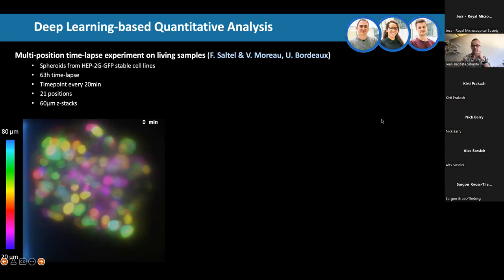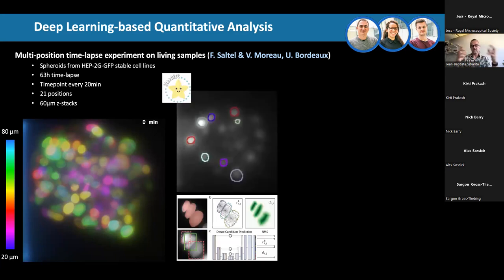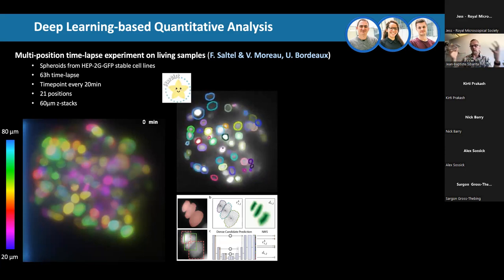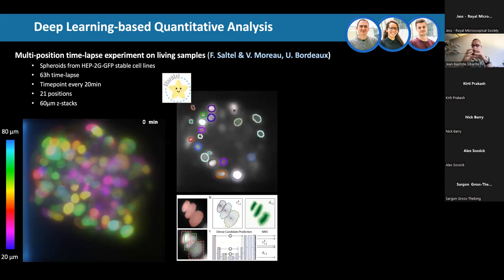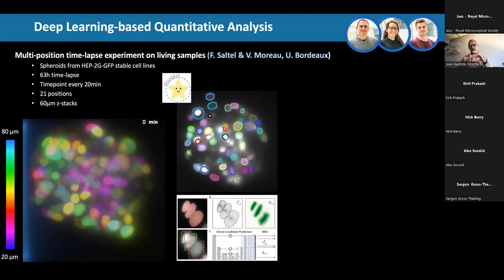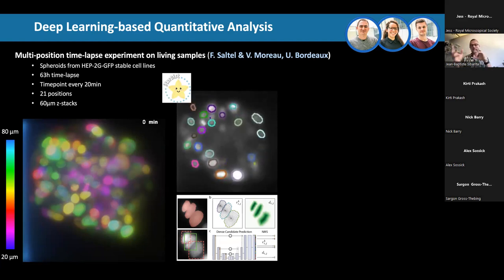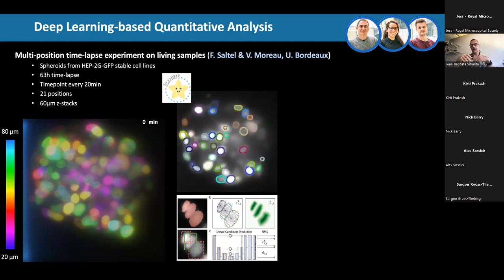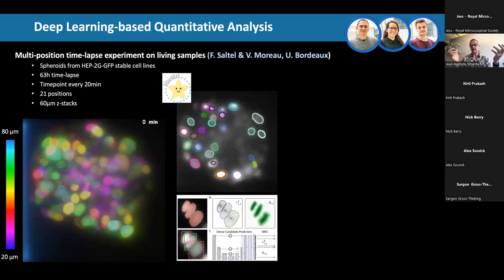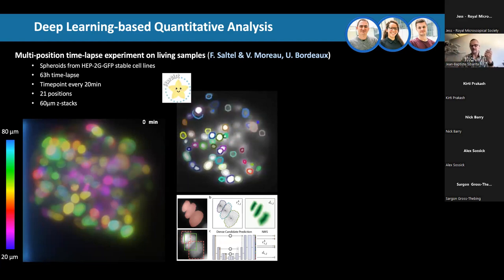It's been a couple of years, and we have a few students working, trying to implement state-of-the-art analysis for the 3D system, which is not very obvious. One of the fields, of course, is deep learning. We are now trying to implement into the whole flow some deep learning tools to be able to at least segment the cells. This is what we expect: doing segmentation and getting, let's say, morphodynamic analysis would allow us later on to do classification and phenotypic analysis, because that's what we think the technique is good at.